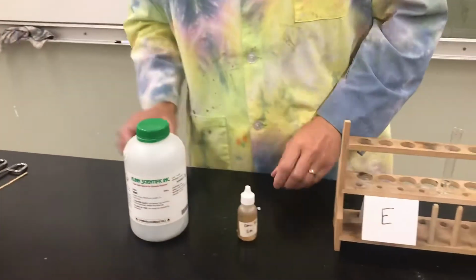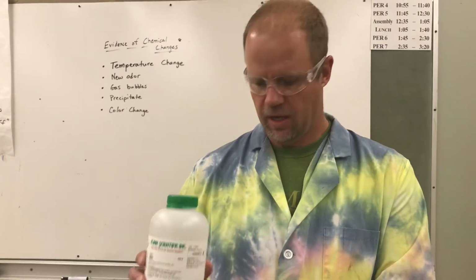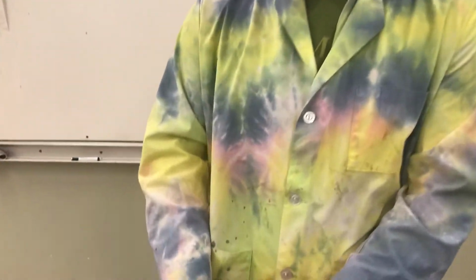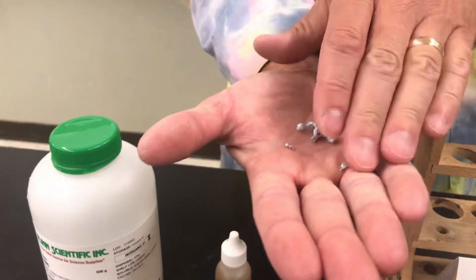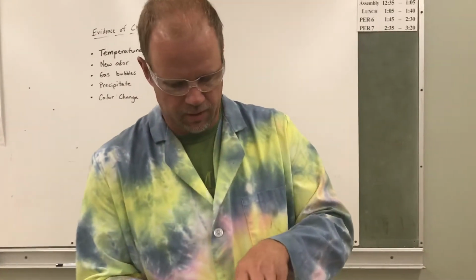Now, what I'm going to do this time, instead of putting in another solution or a liquid, I'm going to put in some zinc metal. Okay, now zinc metal is used in a lot of different things, and it's kind of a soft, sort of dull looking metal. You can see that there. And I'll put these pieces in, and we're going to look for these evidences of some kind of change happening.